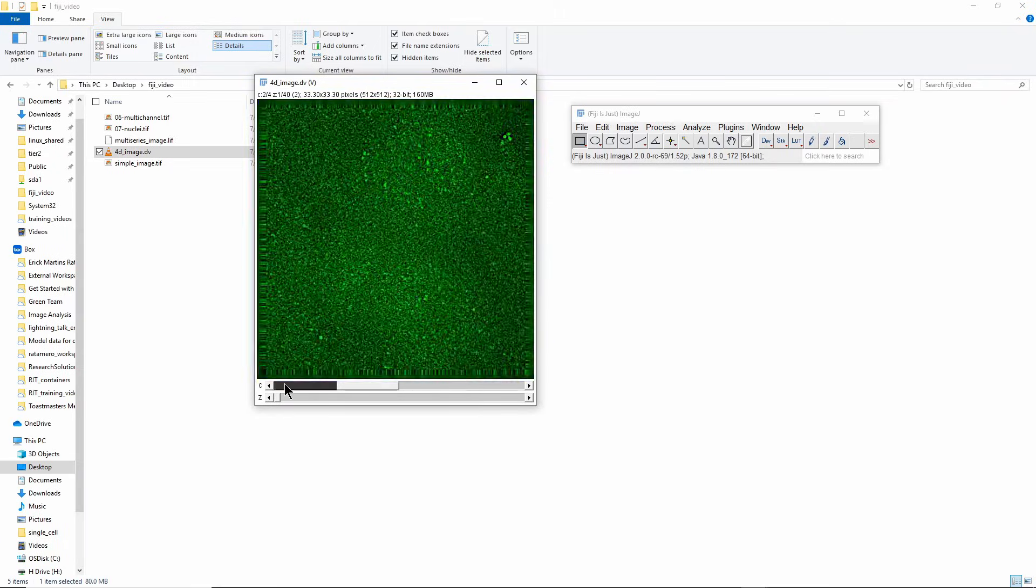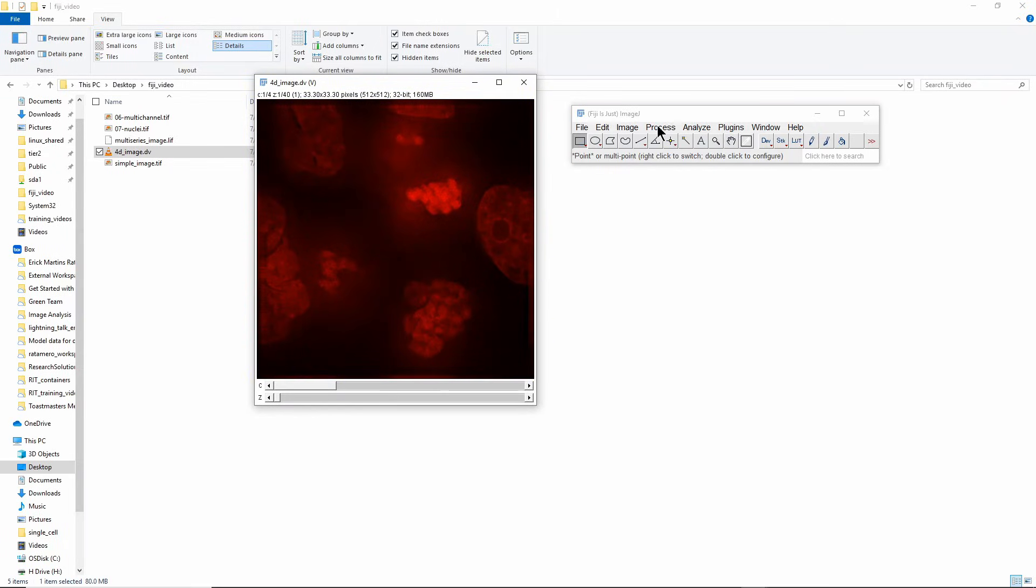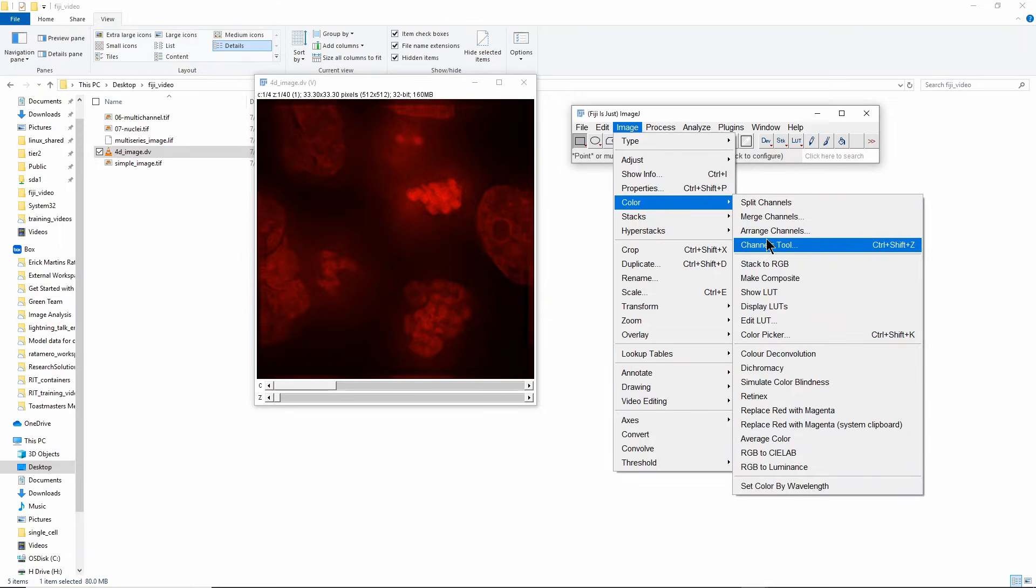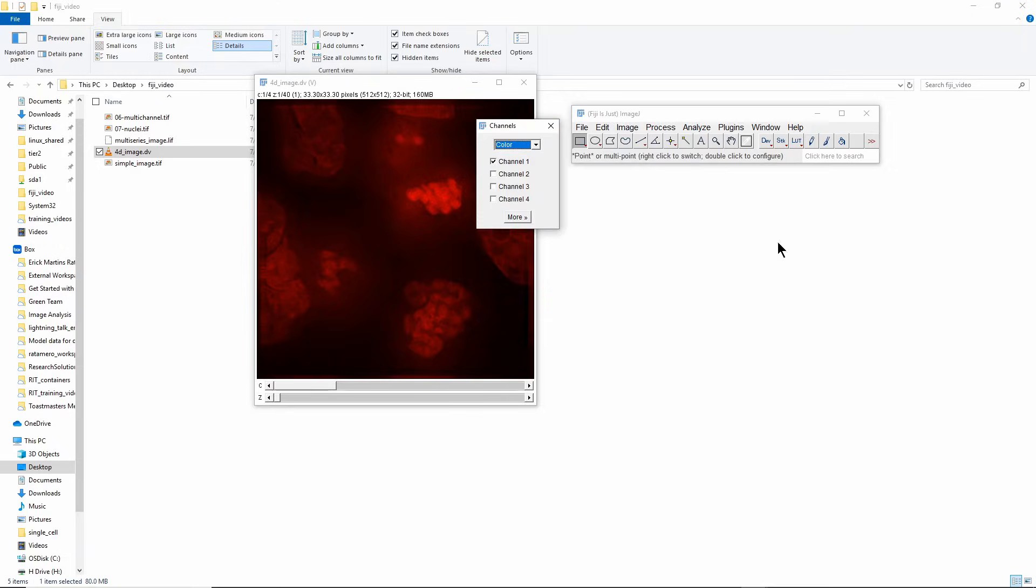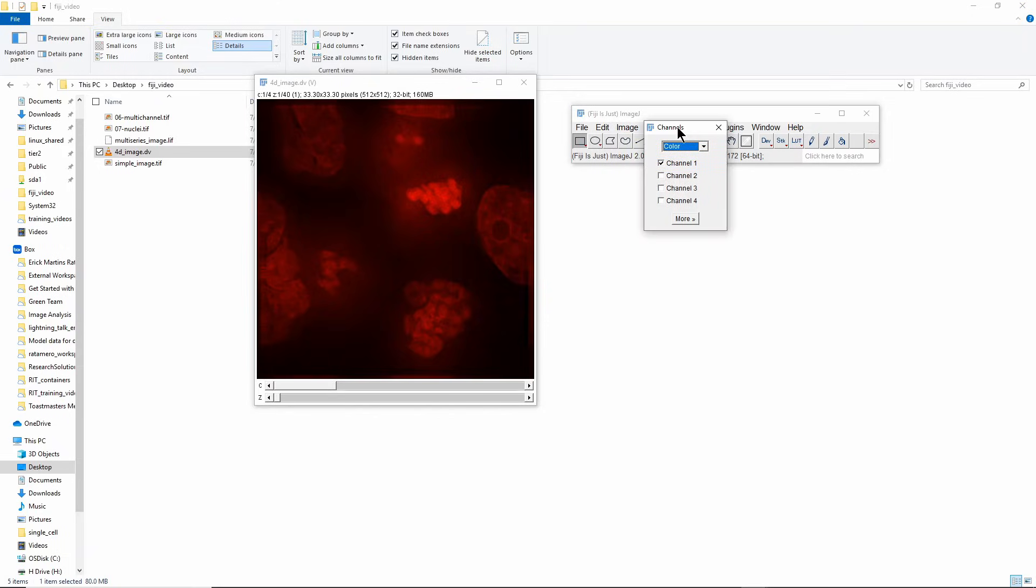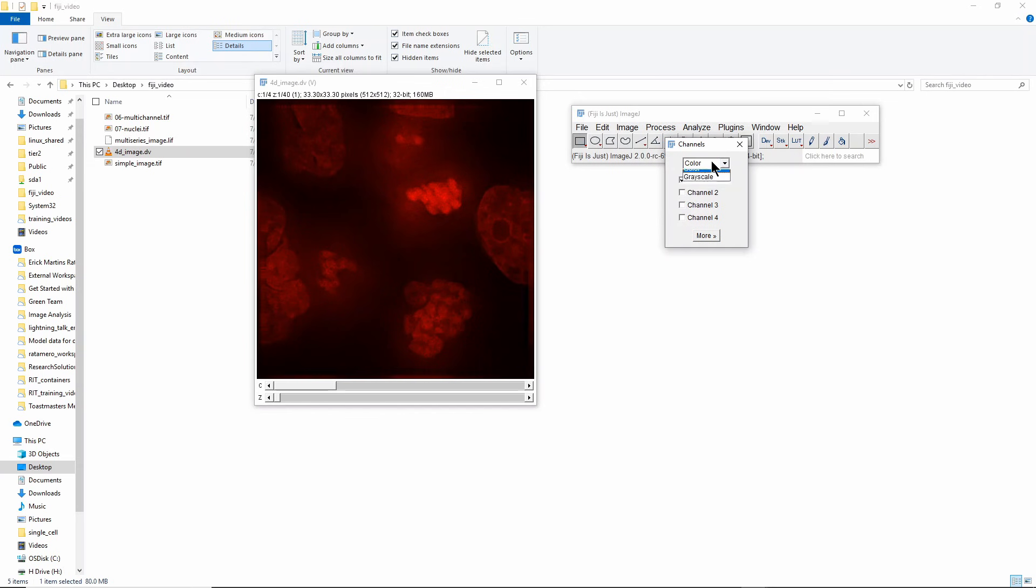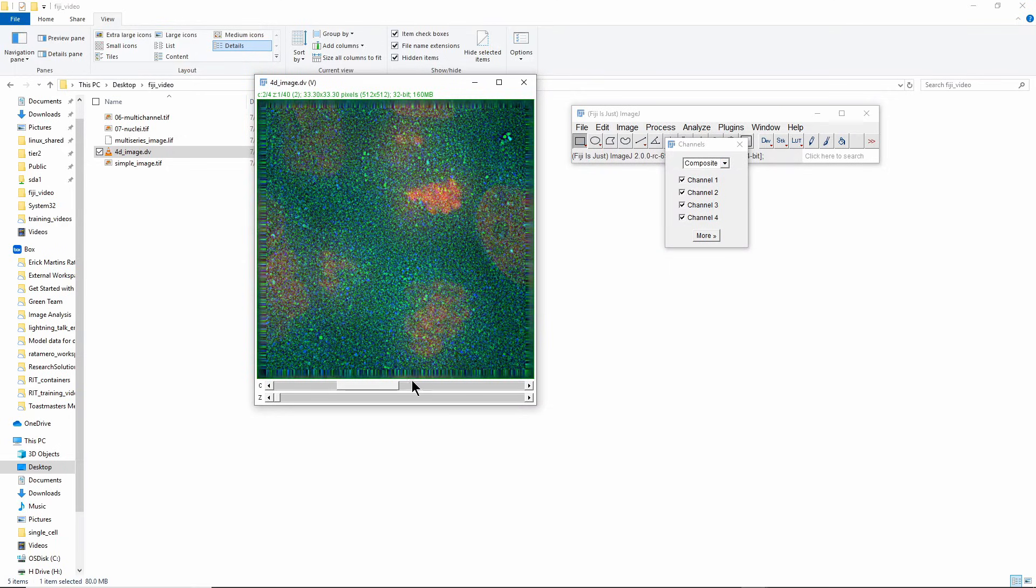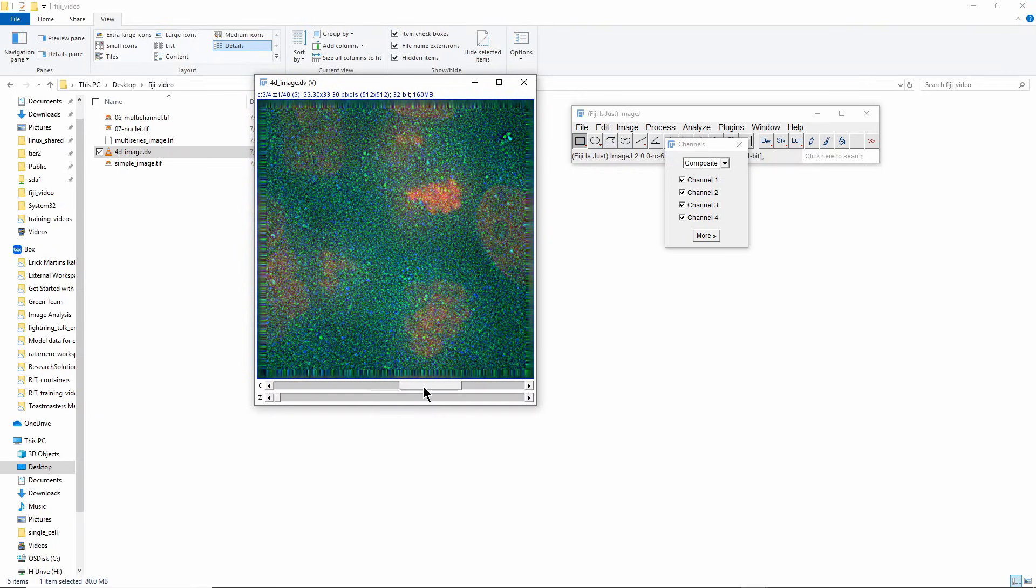I said you can show colors in different ways, so the main thing you're going to use for that is in Image > Color > Channels Tool. That's a tool that will allow you to change how you're seeing the colors here. For example if I change from Color to Composite, it's going to put all four channels together in one single image no matter which channel you pick here at the bottom. You can see that by changing the channel here I change the color of the bar at the top, so I'm still selecting different channels, I'm just visualizing all of them at the same time.